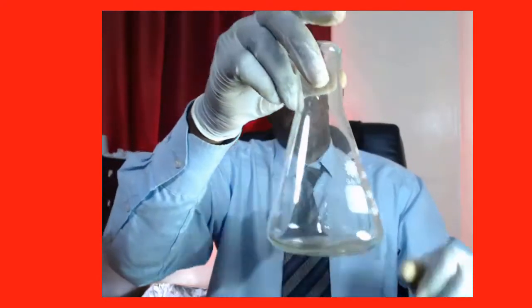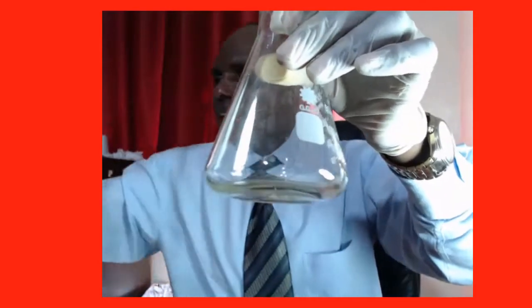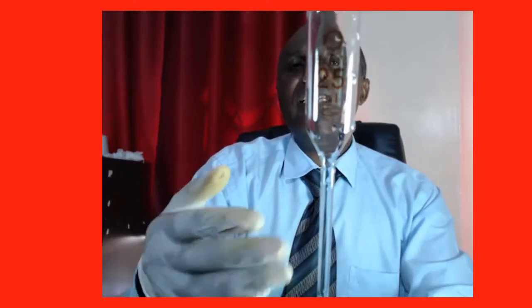During the titration, we need to know the volume of sodium hydroxide we have placed in this conical flask. Therefore, we are going to use a pipette. This is called a pipette, and a pipette has its capacity, and we have different types of pipettes. Some have a capacity of 20 mL, others 10 mL, others 25 mL, and so on.